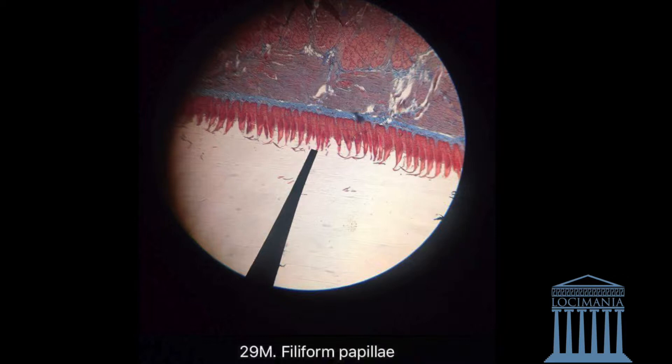Here we have the filiform papillae on the outermost side of the specimen. These are the filiform papillae — as you can see here, they look like some brushes.